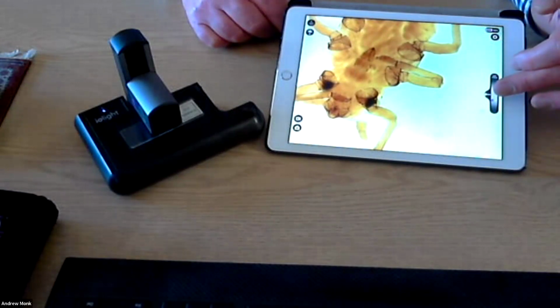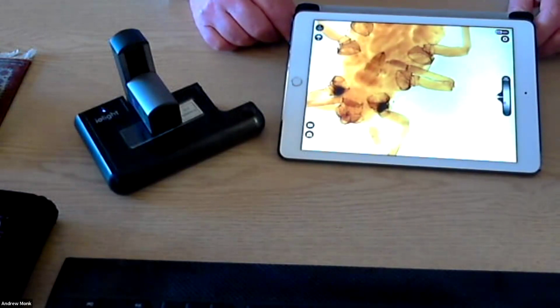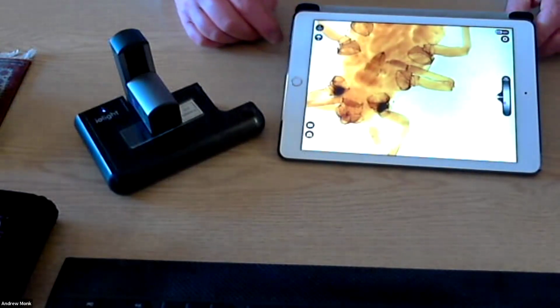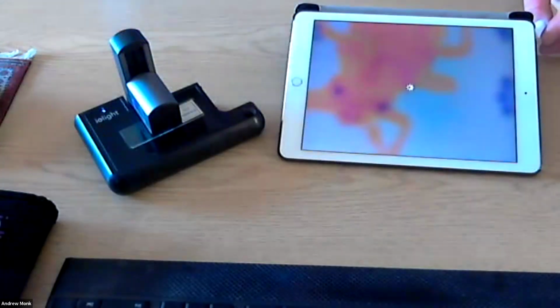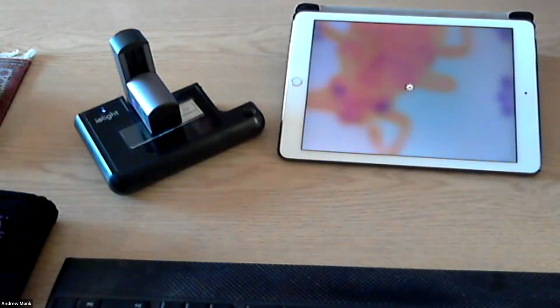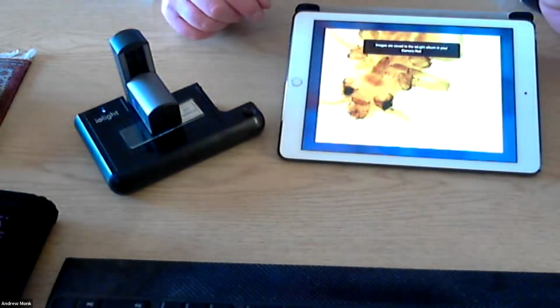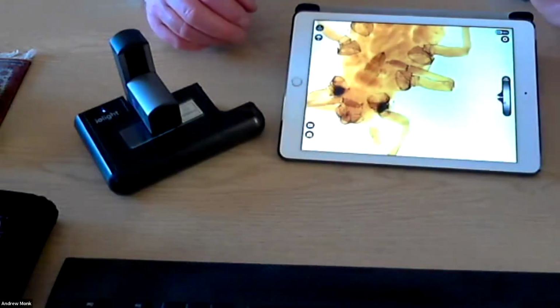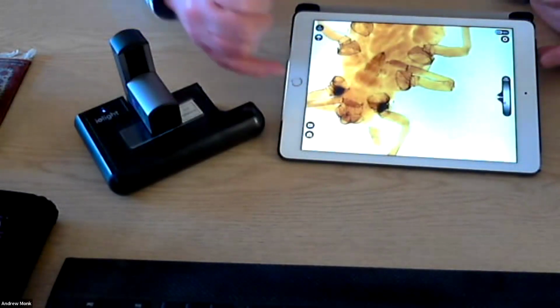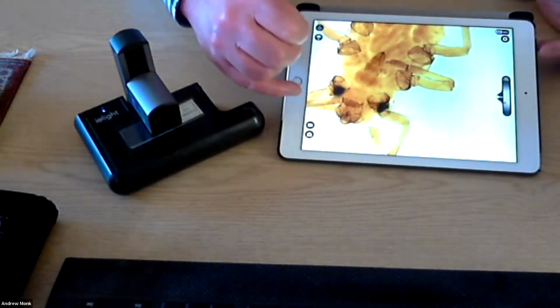And some of you who can see that very well, I know it's difficult, you may notice that's an aphid. So it's a green fly or something like that. And we can just tap on the camera here, and that records what you were looking at before as a video, but now this is a 5 megapixel high resolution image that's saved on the camera roll, and we can now just share that using any image sharing app. Very, very simple. I don't want to take up too much time unless there are specific questions.